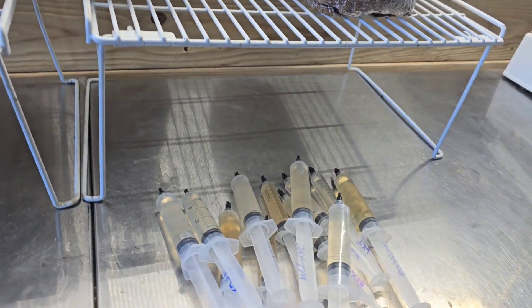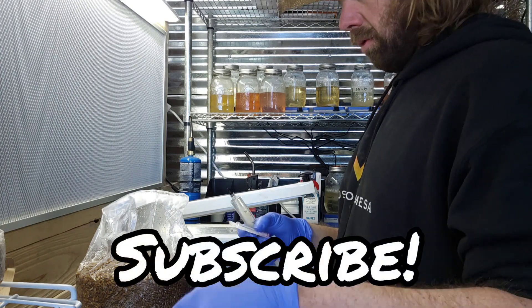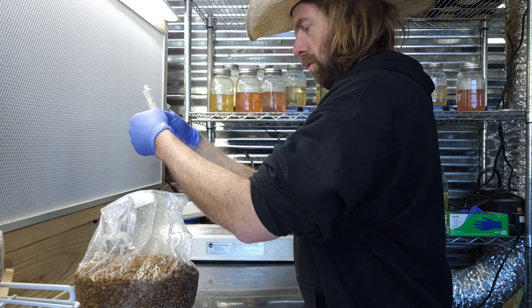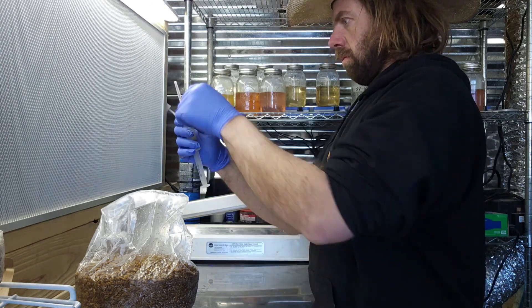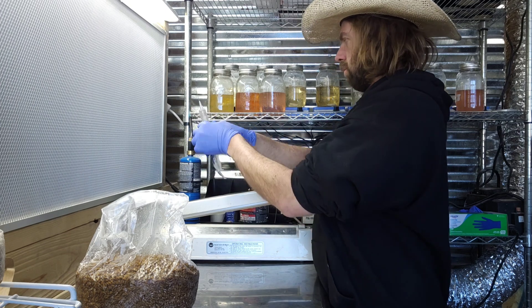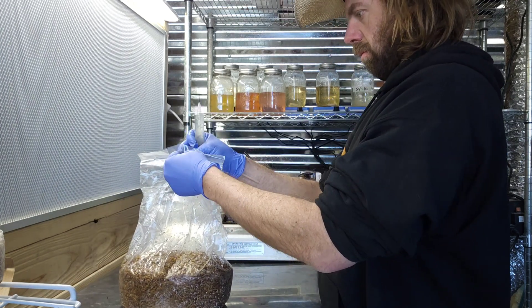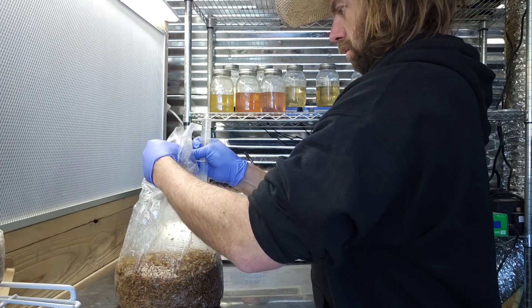I'm going to talk you guys through a voiceover of what I'm doing here and we're going to do a couple bags together. My flow hood is on. I've taken the cap off my syringe, I'm taking out one of those sterile needles and putting it on the syringe. Then I open up the tops of the bags — these bags don't have injection ports. Now I'm flame sterilizing the needle. I know it's not entirely necessary since it's pre-sterilized, but it's an OCD habit of mine.